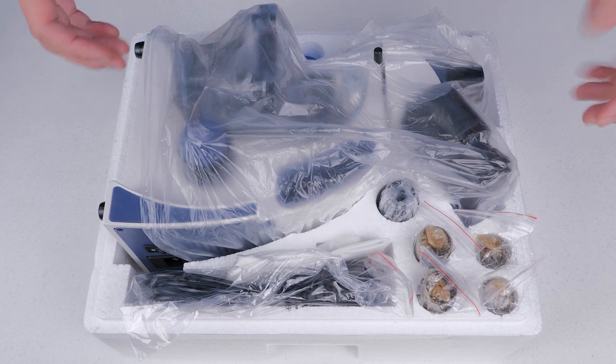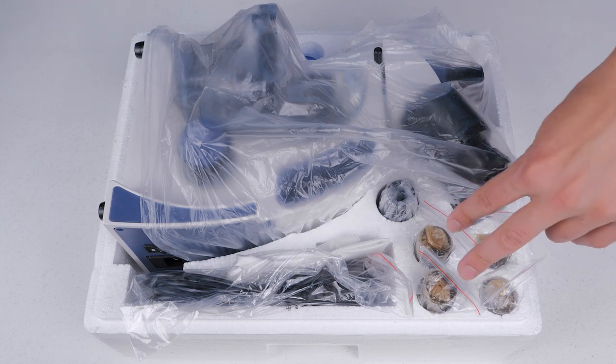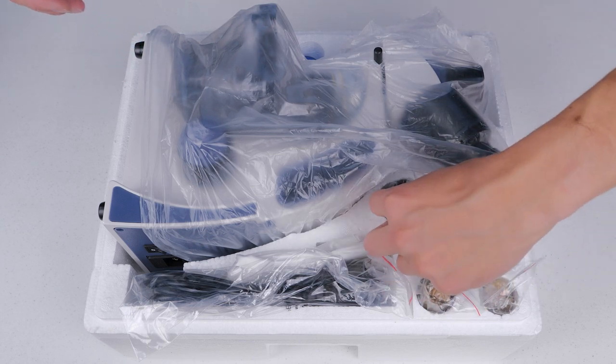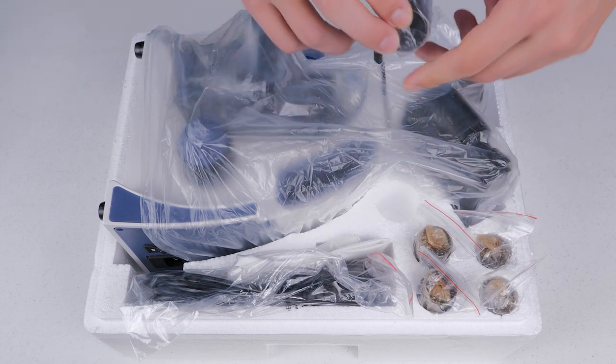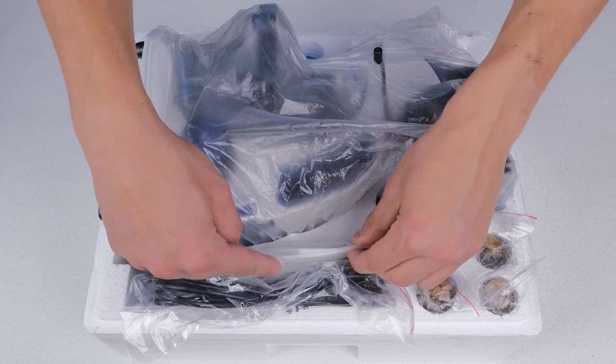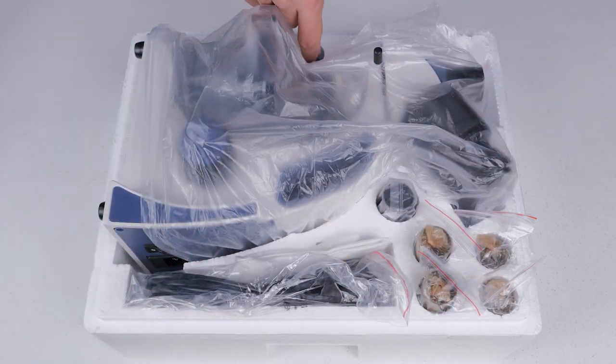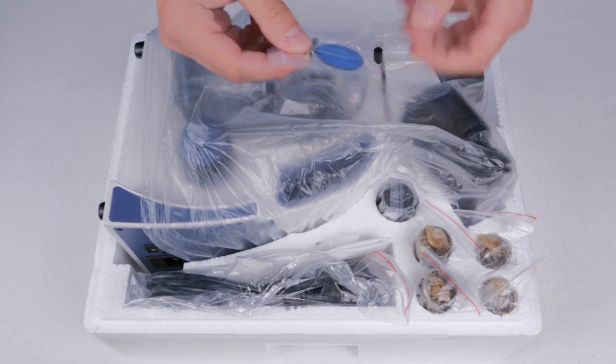In the microscope box we have the microscope itself, two 25X eyepieces, two 10X eyepieces, a C mount adapter for the camera, a dust cover, a table, a blue light filter, and a fuse for the microscope.